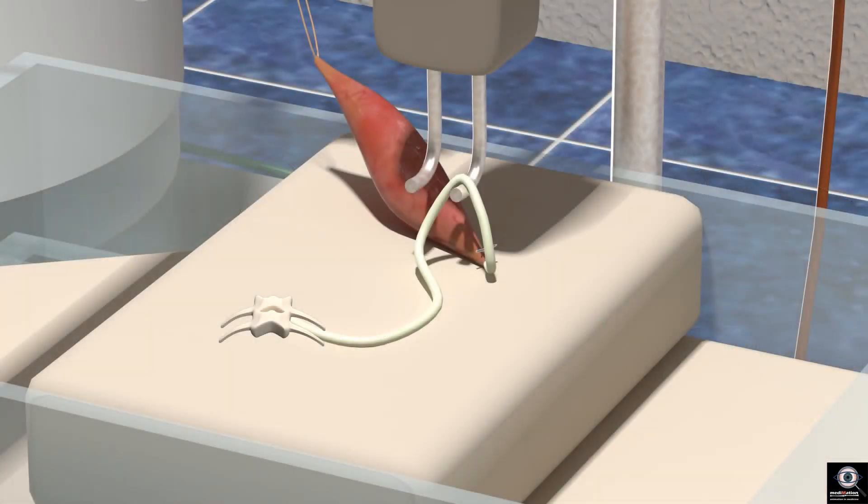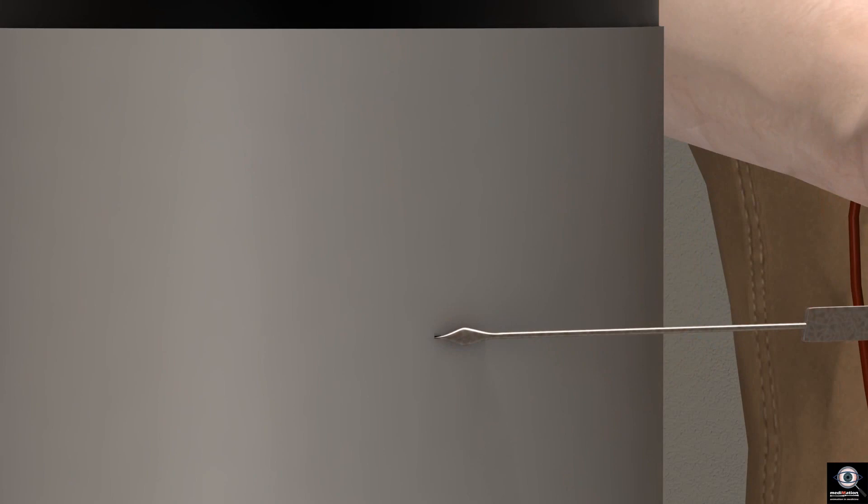Now, we place the stimulating electrodes closer to the muscular end of the nerve. We mark the point on the nerve where the electrode is applied. We stimulate the nerve and record the muscle twitch.